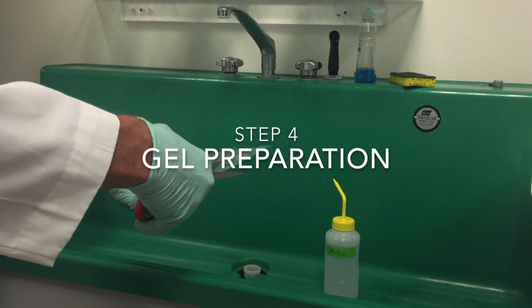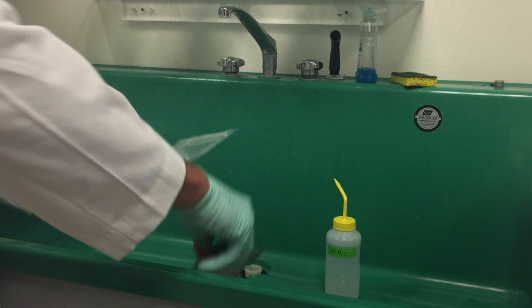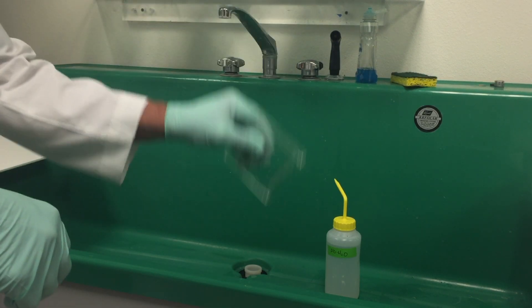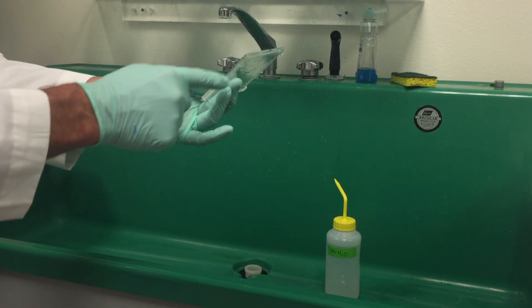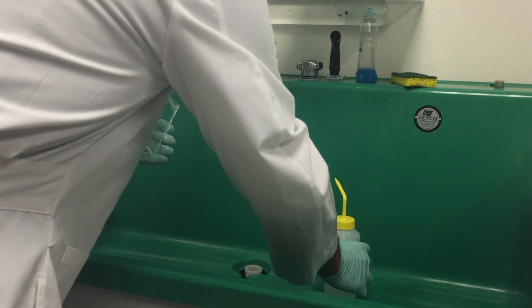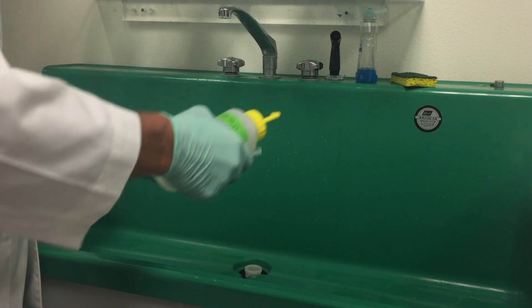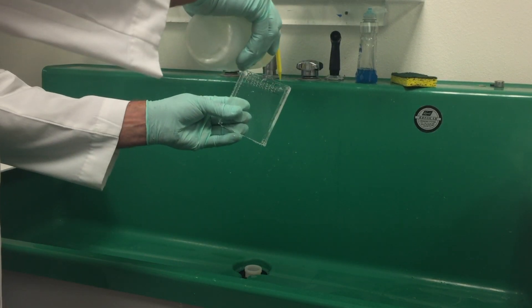Gel preparation. Just before use, remove the gel cassette from its plastic storage bag and shake off upside down. The comb has been removed from these gels prior to shipping and there is also no tape to remove. Rinse the entire gel cassette using UltraPure water with a wash or squeeze bottle. Rinse the wells two times using UltraPure water with a wash bottle, and shake to remove water from the wells after each wash.